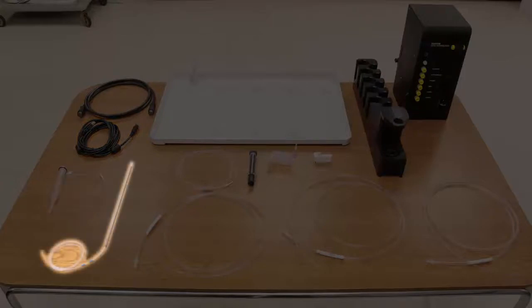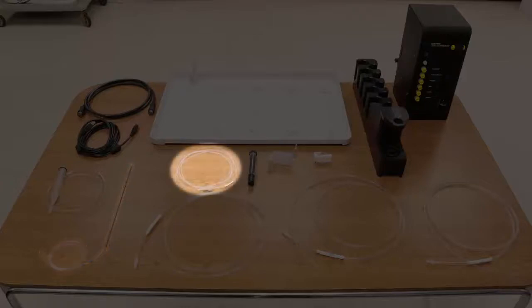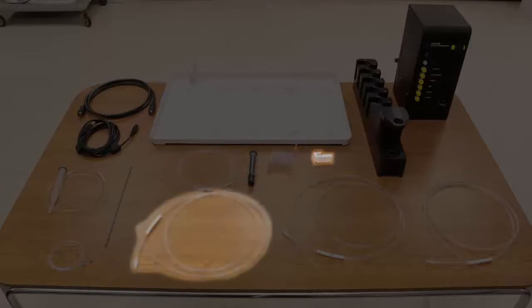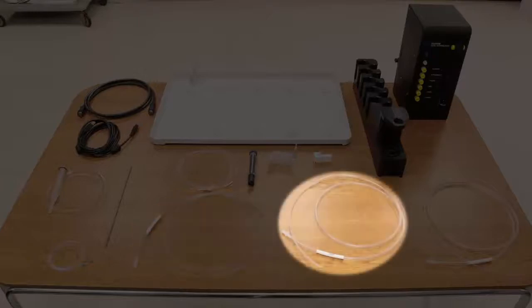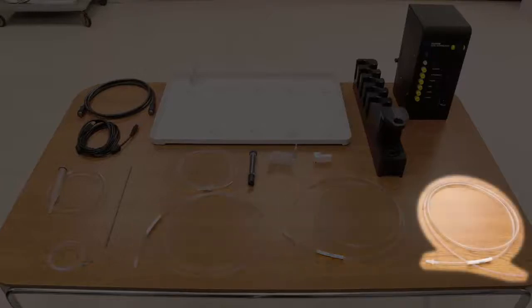You'll also need a sample probe with separate nut and ferrule. We will be using a 1.0 millimeter probe. Additional components include the ICP tube, the syringe, the sample loop, the tubing clip, the syringe diluent tube, the waste tube, and the rinse tube.